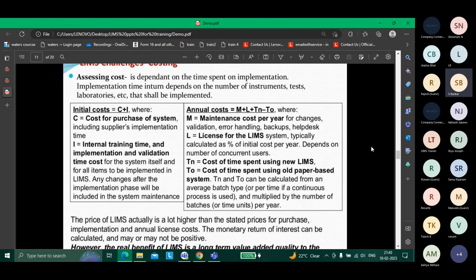Yes, but how are we going to train? Will you teach in the LabLIMS development server only, or no? I don't have access to the server of LabLIMS. I'll teach you with certain screenshots. I have zero access to LabLIMS servers. Okay. So in those screenshots, where do we need to go in the lab management folder? LIMS generally you will get access. Maybe if you work in Labware, that's a separate question.